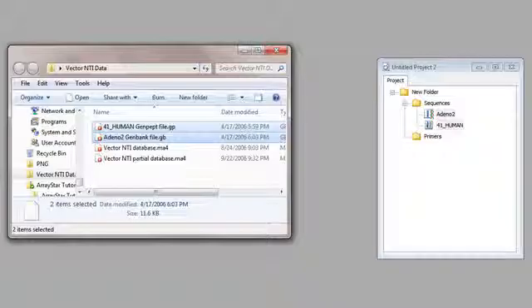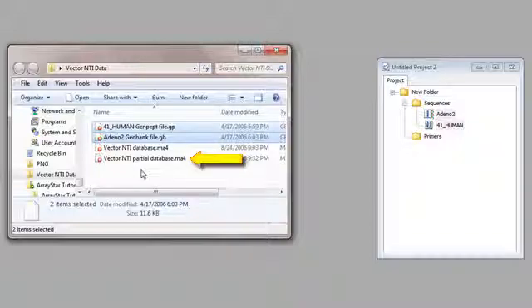With the database archive, I'll drag and drop it right into its folder. This saves an extra step.